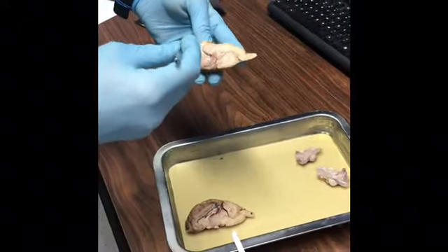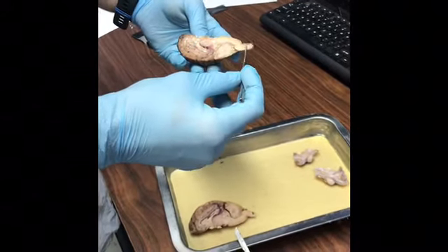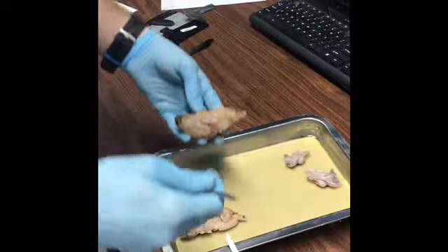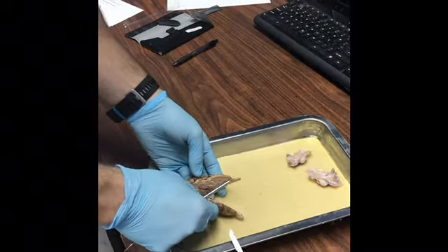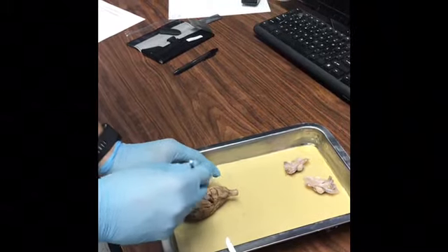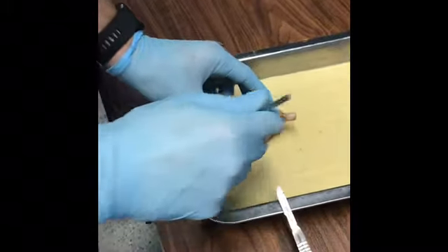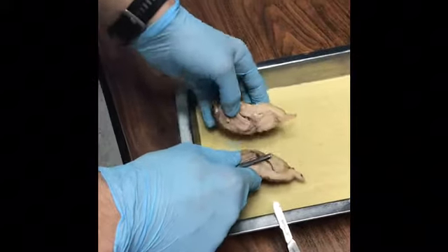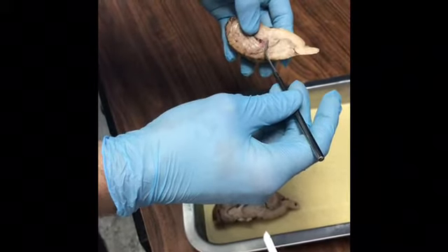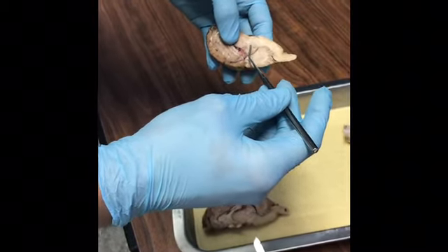So the next part we'll go over is the brainstem, which is this part that runs all the way through here to the spinal cord, and then we'll go over the midbrain. The midbrain cerebral peduncle is this part that's right here, and when we open it up, we've got the inferior colliculus, which is right here, and then the superior colliculus, which is right here.